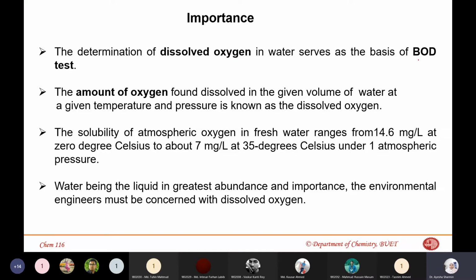The biological oxygen demand, or biochemical oxygen demand, is important because you need to find out how much algae is growing there. If you see the BOD becoming highly excessive, you can find out the biological oxygen demand from the dissolved oxygen calculation over a 5-day period and with different dilutions of the sample. And you can say that this water is going to have a bloom soon, and this can cause problems.